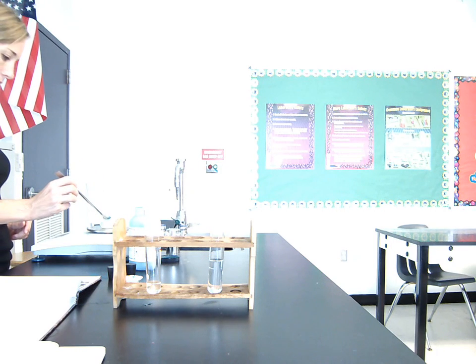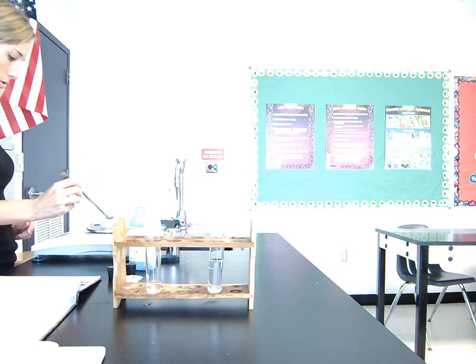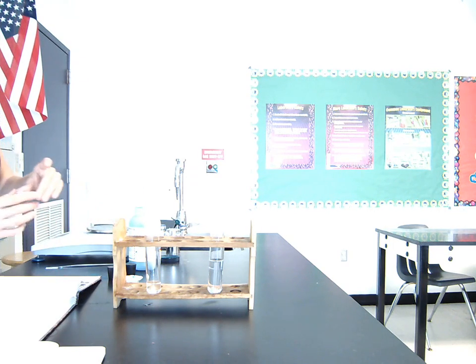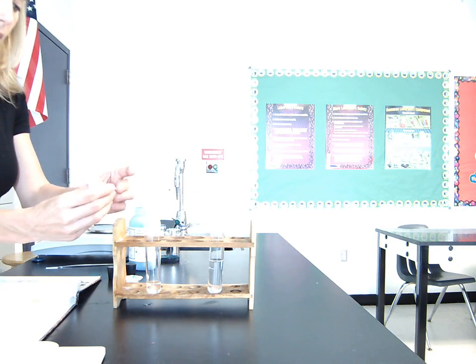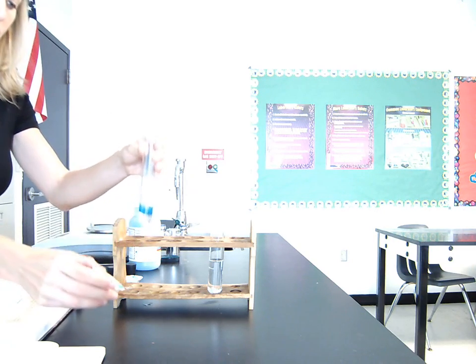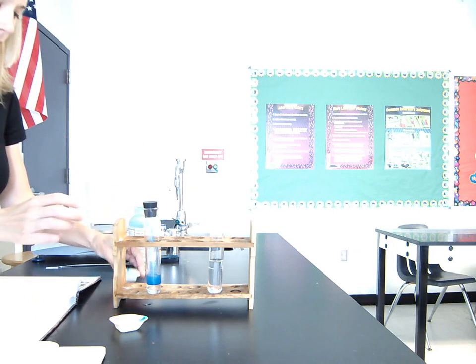Okay, so I've got 0.15. Perfect. Now in each of these two massing dishes, I have 0.15 grams of blue stuff. So I'm going to add 0.15 to the 5 cubic centimeters of water. I'm going to stopper it and I'm going to shake it.